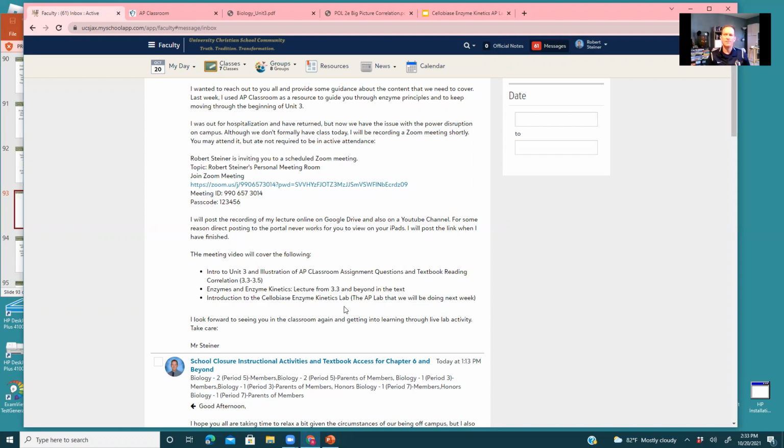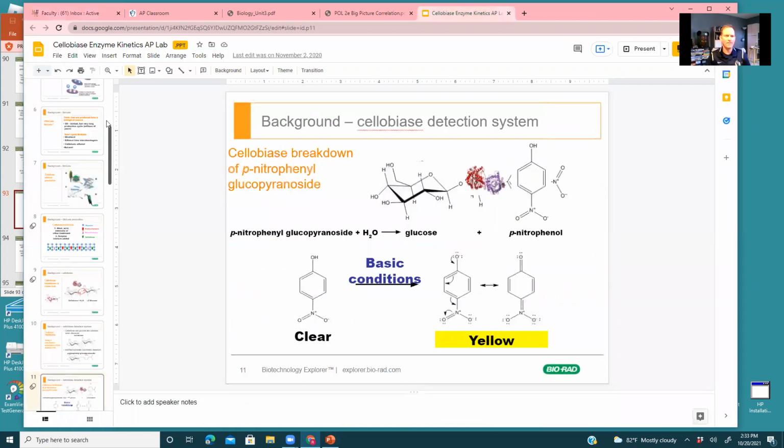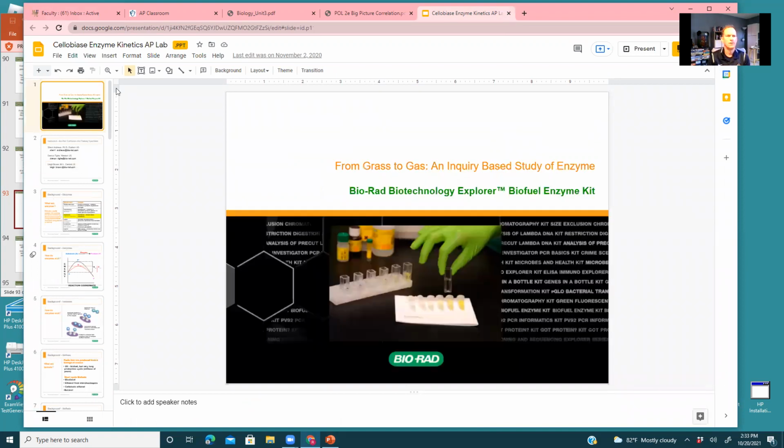Okay. Now, hopefully we're back and we're ready and moving on. The next phase of our talk is going to be the introduction to the Cellobiase enzyme. What I have up on the screen is the slideshow I'm going to post to our course page. And we're going to do a lab where we're going to explore the process of doing enzyme studies using light indicators.